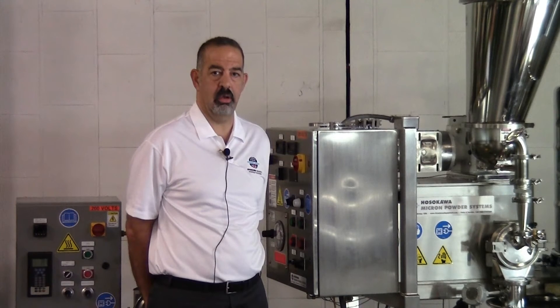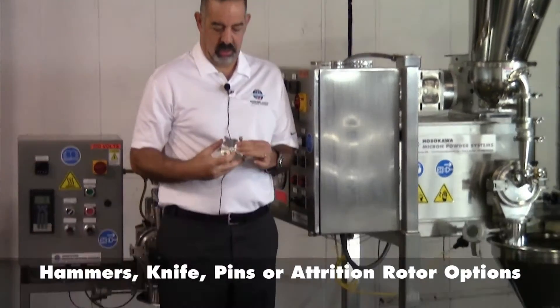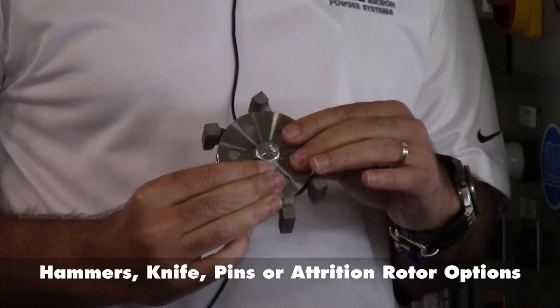As I mentioned, we wanted to add more flexibility to our Universal Micro-Pulverizer line. With our Micro-Pulverizer line only being a hammer and screen mill, we wanted to add a variety of rotor options to it. Here I can show you the different rotors available, starting with the standard stirrup hammer rotor, which is used as a hammer and screen mill for medium to fine grinds.